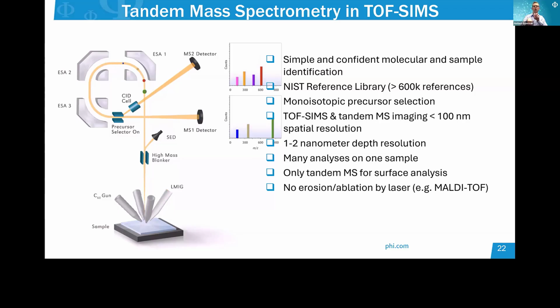Secondary ions emitted from the sample surface travel in a circular path toward the detector called MS1. In this circular path, the ions are deflected by 3 pairs of focusing electrostatic plates. This circular motion makes it useful for the analysis of samples with rough surfaces.